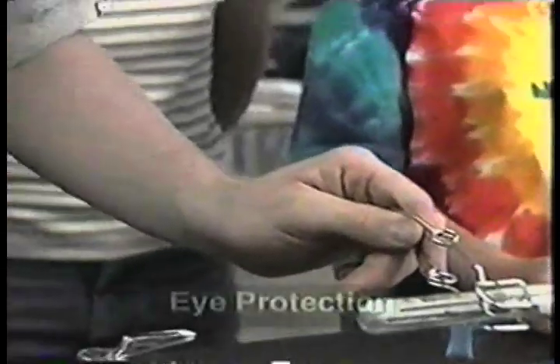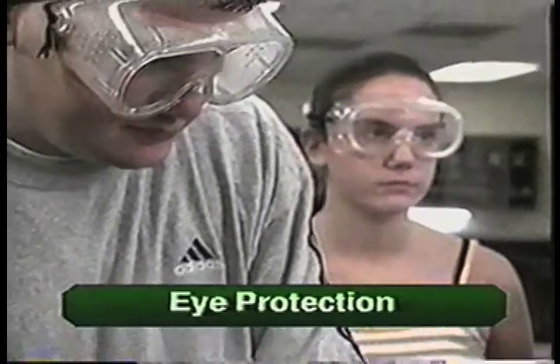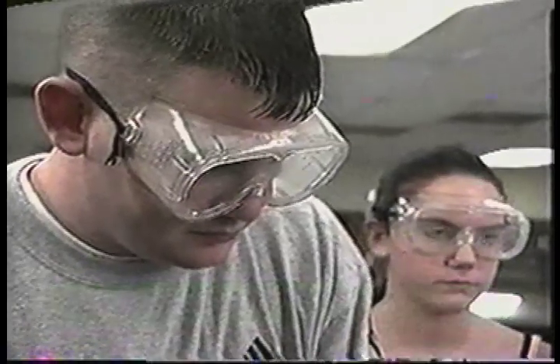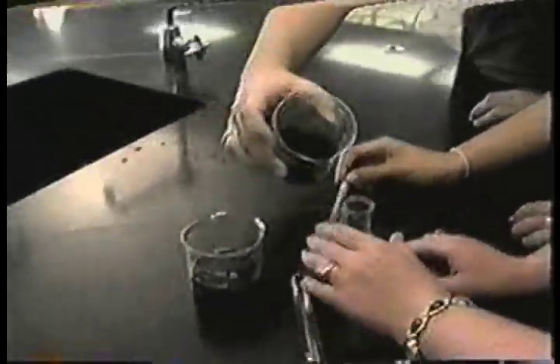Goggles are pretty standard safety gear. Well, maybe not pretty, but they are standard. They protect your eyes from your experiment, and the experiment that someone else is performing beside you, and the experiment performed 2 tables away from you. Splashes and splats and flying objects have a way of traveling to unwelcome areas. And yes, you need to wear goggles even if you wear glasses.